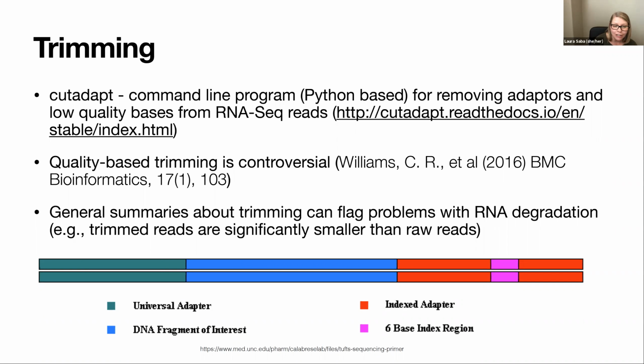But in general, when we do trimming, hardly any base pairs are trimmed off. Our average read length, if we start off with 100, is usually 99. And we get rid of very, very few reads in the trimming process. So we're not as concerned about what it does downstream for our alignment as much as we are about using it as a quality control measure.